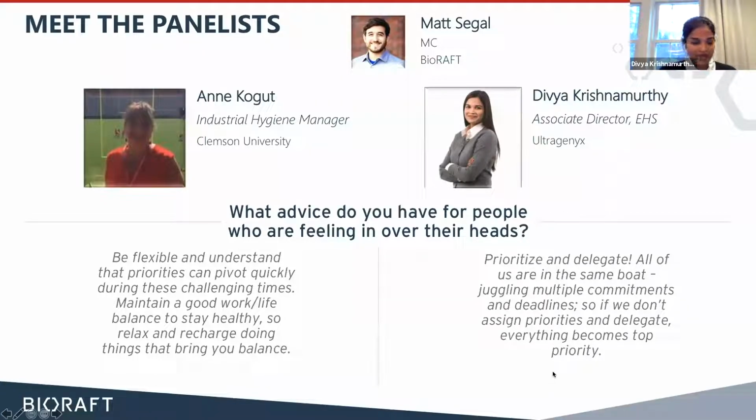So, like I said, I don't know if this is really efficiency, but we've kind of resorted to just saying, let us know what you need to be disposed, and then we can do the reconciliation. That's the approach we've taken. The other thing, again not necessarily efficiency, is that we were really lacking before: we have a system for safety data sheets, but they weren't always getting updated.